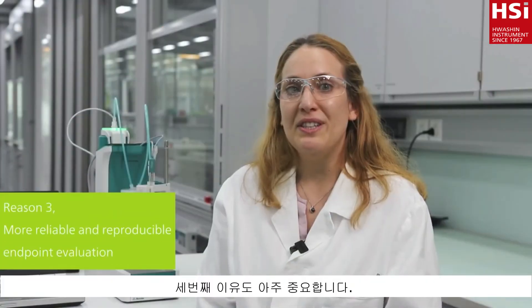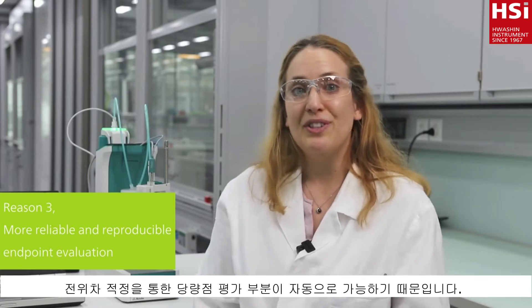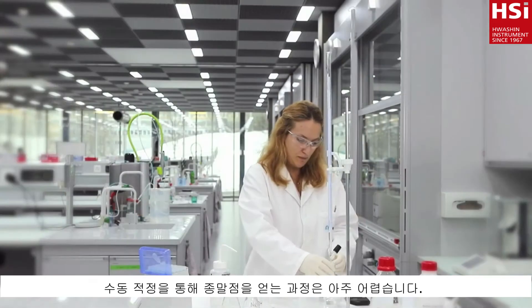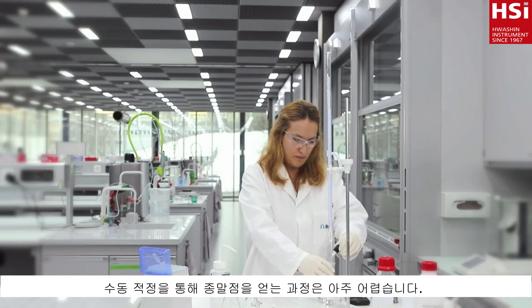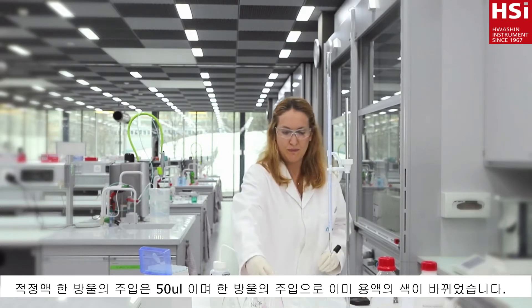My third reason is also very important. With automatic titration, the titration endpoint is evaluated automatically. This means your results will be more reliable and reproducible. When performing a manual titration, detection of the endpoint can be difficult. One drop of titrant can already drastically change the color of your solution.